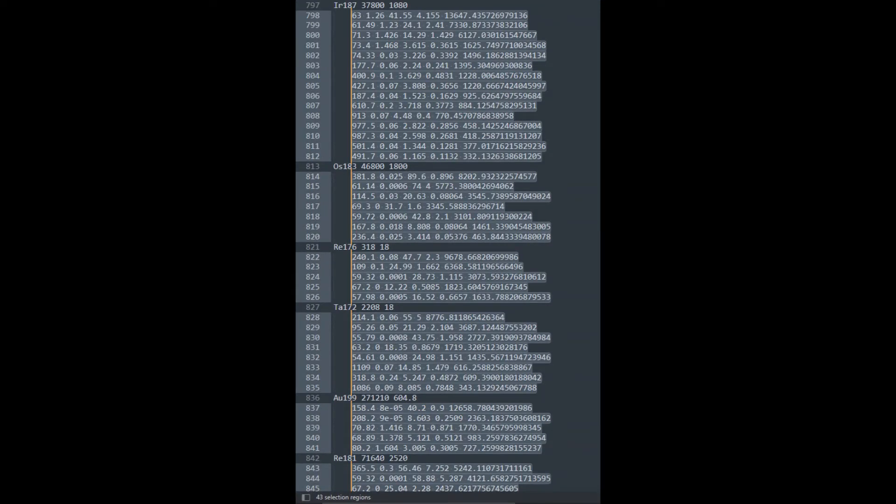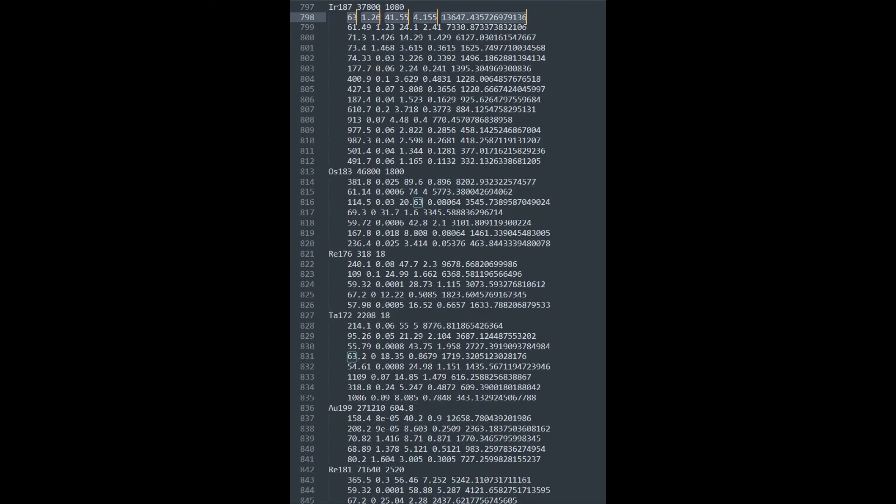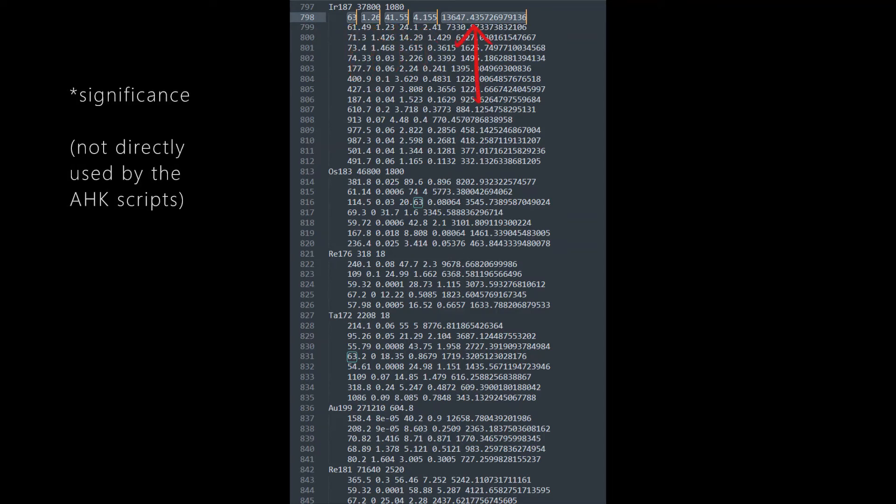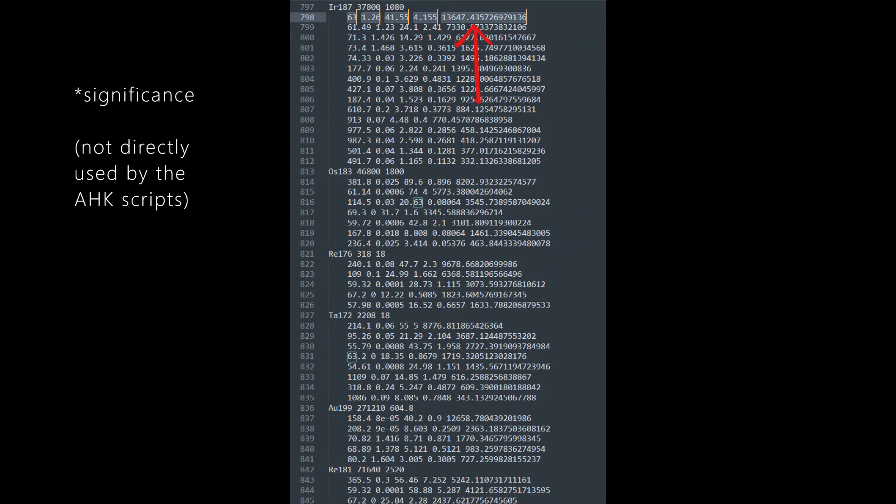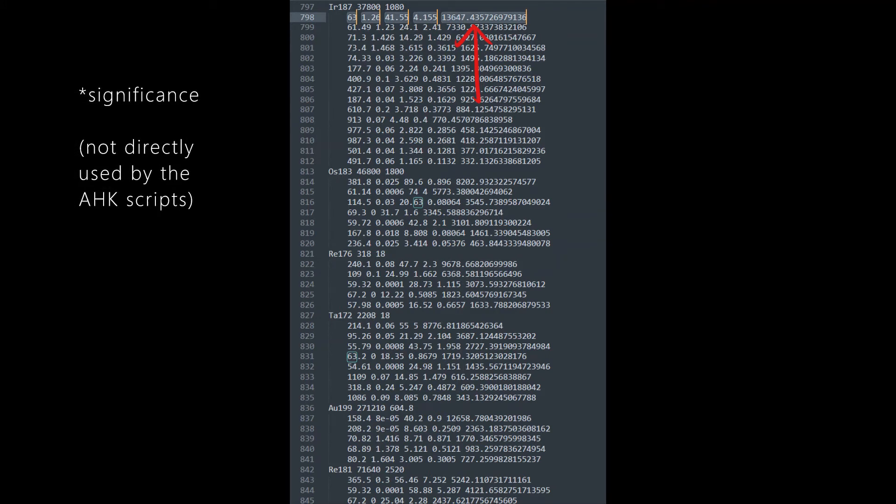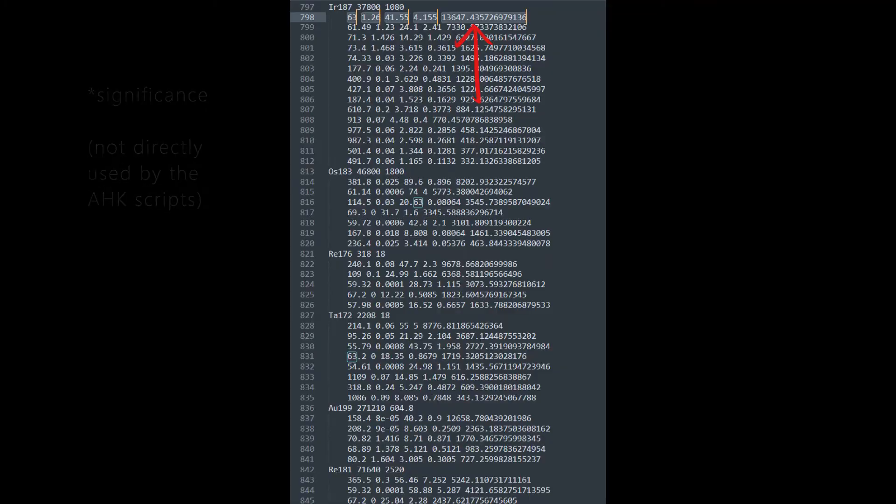Each of these highlighted lines represent a gamma line. Specifically, its energy, uncertainty on energy, abundance, and uncertainty on abundance. The fifth number is a number that I call significance, which I'll come back to later. This won't be entered into the nuclide library editor.